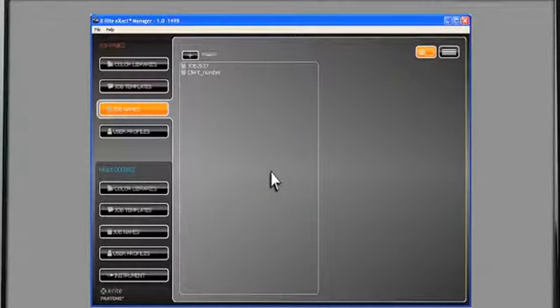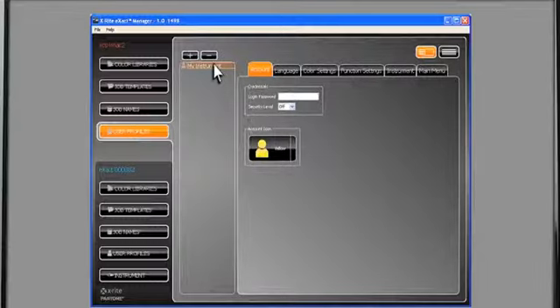Finally, select User Profiles from the local data. A user profile is a collection of instrument settings that can be customized for individual users for different workflows and user requirements. These can be added with the plus button or by selecting Import User Profile from the File menu. When in the Detail view, you will see all of the settings that can be changed for this user profile as tabs along the top.